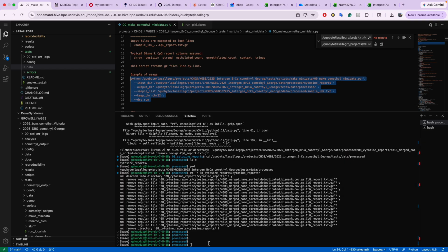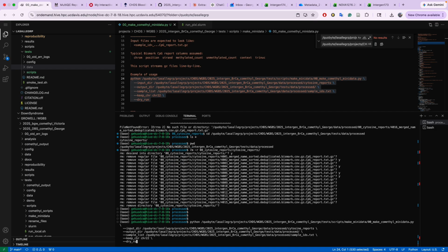Okay. This time we just skip the dry run because I know it's working. And then we'll double check on this as it's going.